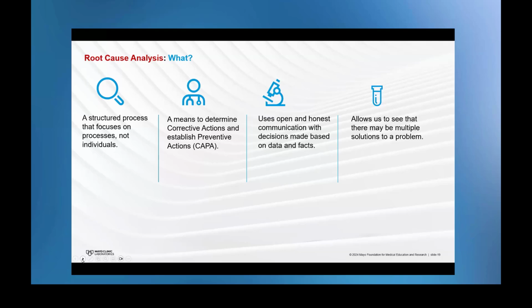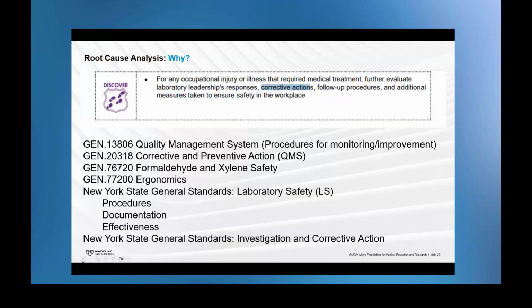So, that's the what. How about the why? I would love to say that the only reason we do RCAs is to make things better and safer so that bad things don't happen again. For better or worse, there are laboratorians out there that believe that the way we've always done things is the best we can do. Fortunately, we have some accreditation and regulatory bodies that require us to believe improvements are possible. So please don't consider the requirements that you have to maintain a burden. Consider them a tool and a help to push forward having corrective actions.